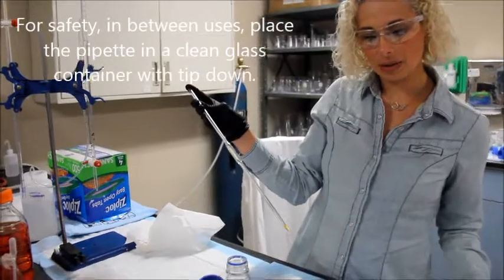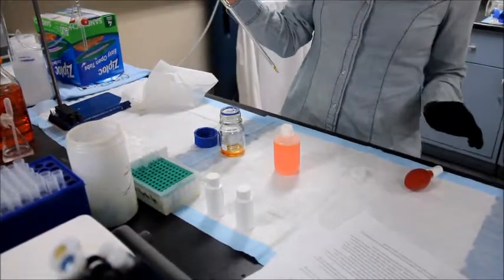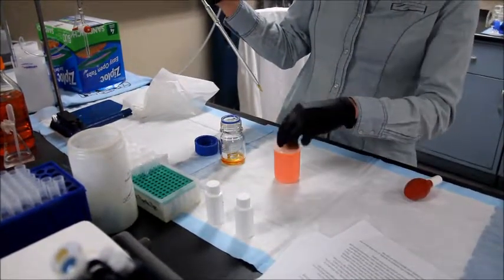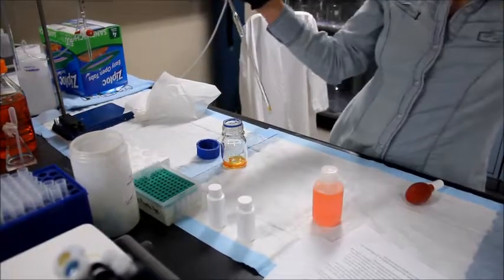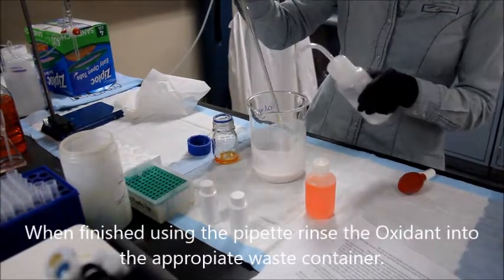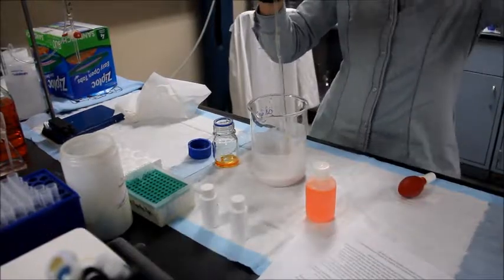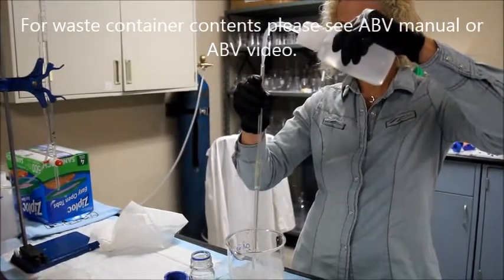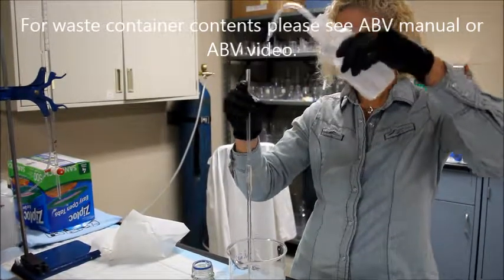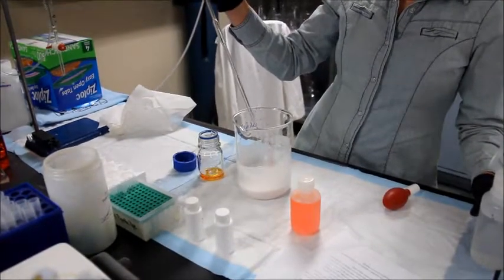When all bottles have been filled, carefully rinse the pipette into the waste container used for spent reactions. See the ABV video for further instruction. Just take your waste bucket, some DI water, and rinse it directly into the bucket and allow it to drain out.